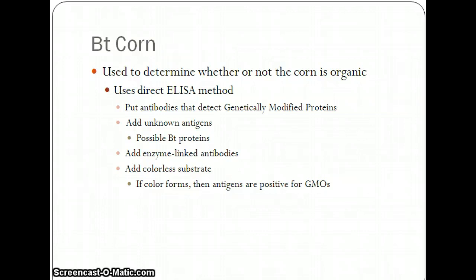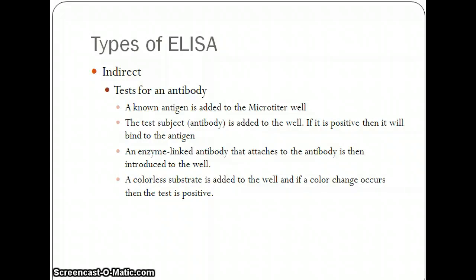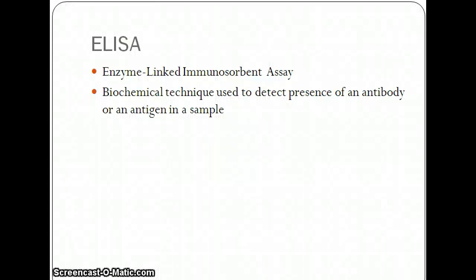Okay, quick review. ELISA stands for enzyme-linked immunosorbent assay. It's a biochemical technique used to detect the presence of an antibody or an antigen in a sample.